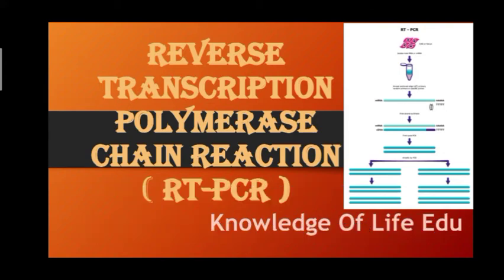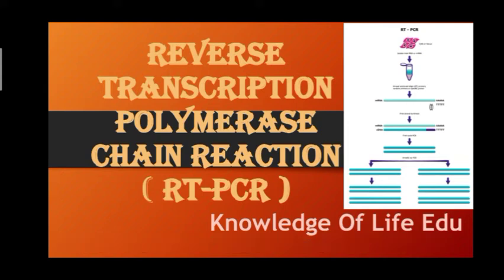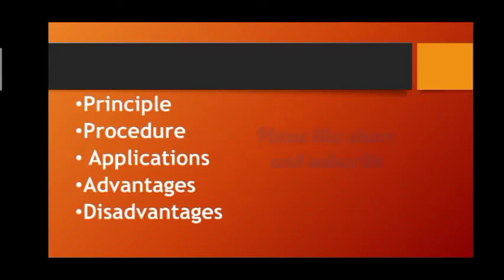During the 90s, Northern blotting was used to study the RNA, but the method was time consuming and unreliable. So, to study the RNA, we need to convert it into DNA first. After the discovery of the reverse transcriptase enzyme, the problem was solved. This reverse transcriptase enzyme is potent enough to synthesize DNA from RNA.